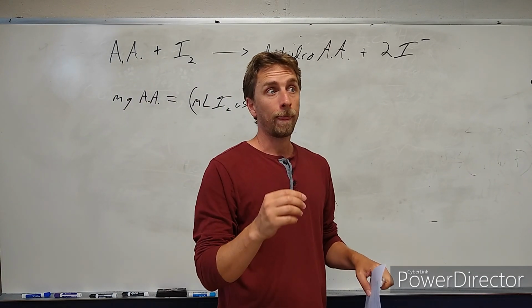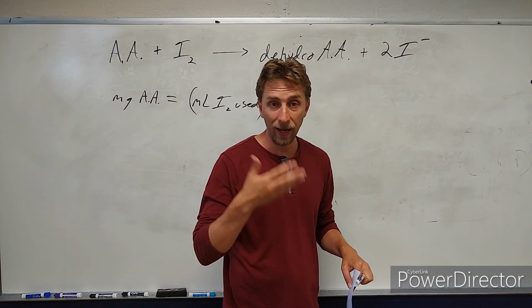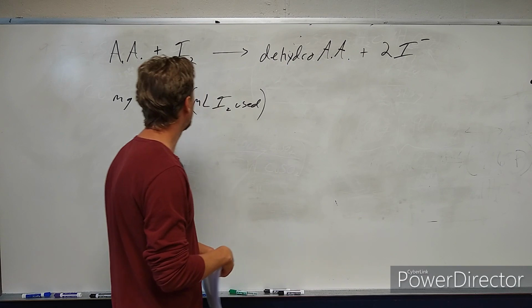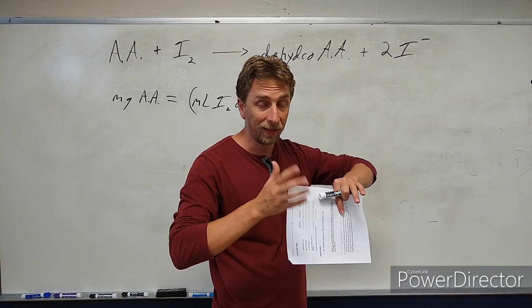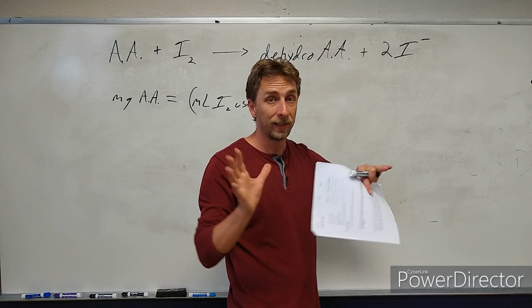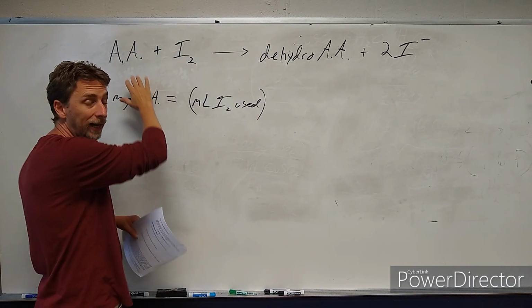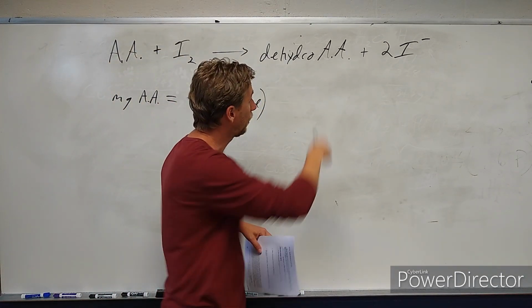Remember, the solution turns purple after you added enough iodine to the juice. And when it turned purple, you are past the end point. Okay? But when the iodine reacts with that ascorbic acid that's in the juice, it gets pulled away from the starch, and so the color disappears. So you added a little bit of iodine, and it hit all the ascorbic acid, it reacted, and the purple color disappeared, and it was all converted to iodide.